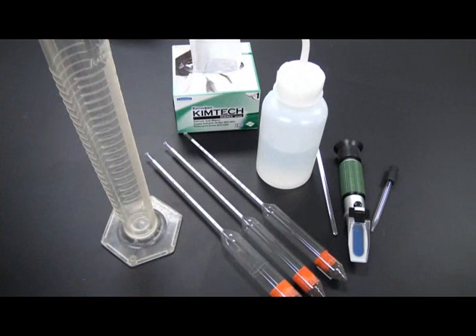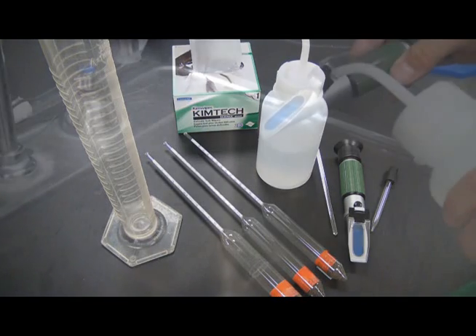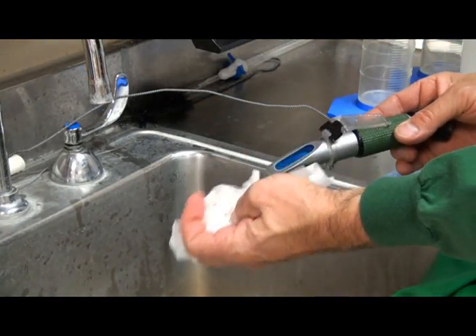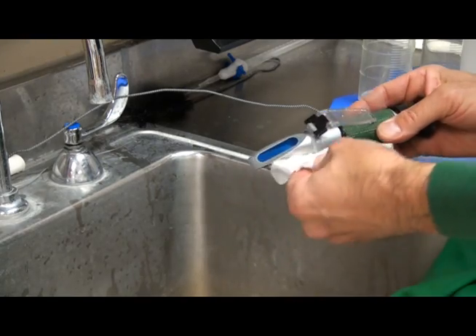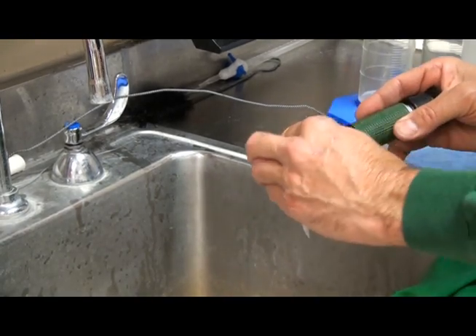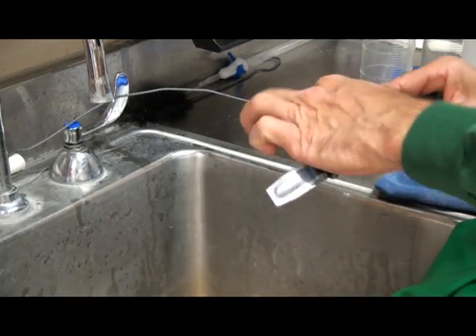Equipment used for testing Brix should be cleaned thoroughly between each test and after final use to prevent cross-contamination of samples. Clean the prism surface and lens cover with DI water immediately after sampling, and dry the lens with a Kimwipe. Clean the exterior of the refractometer with a damp cloth to remove any spilled juice samples.